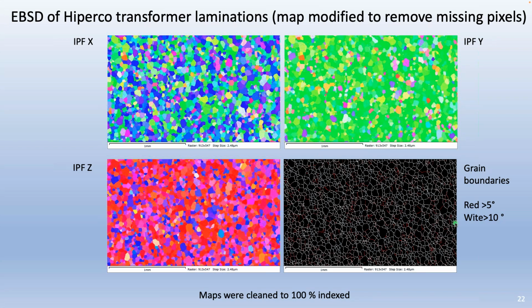And this all goes back to how easy it is to set up the actual experiment in your microscope and how much room you have in your microscope. And then, of course, the EBSD detector comes in from the horizontal or a little bit below horizontal, which I think is better for collecting patterns that are a little bit clearer, a little more intense. You get a few more electrons that way. And so I think there are options here, but I think we are limited quite often by the SEM manufacturers and how they set up their stages and put their ports on their microscopes. So to answer the question, I think there are better conditions, but I'm not sure there's one optimum.